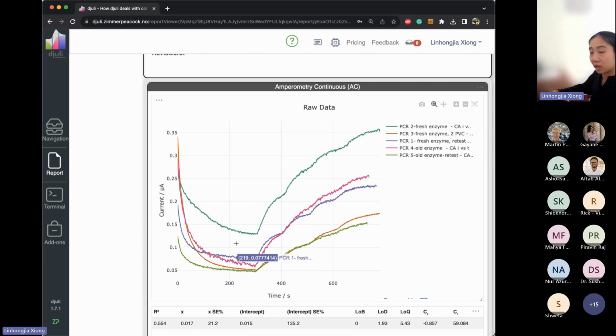This can be due to capacitance or some impurity on the sensor. It can be due to the polymer as well. It doesn't matter what the root cause is. If you want an easy comparison by eye, we need to bring the data down to 0, so that the 0 concentration can be easily viewed.